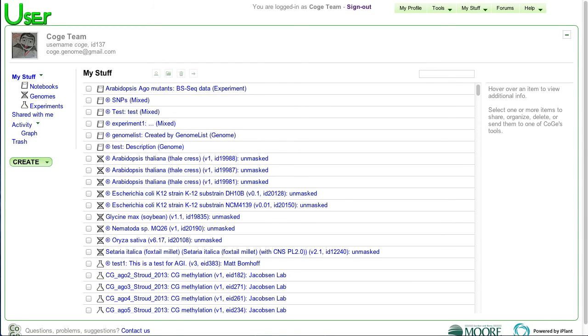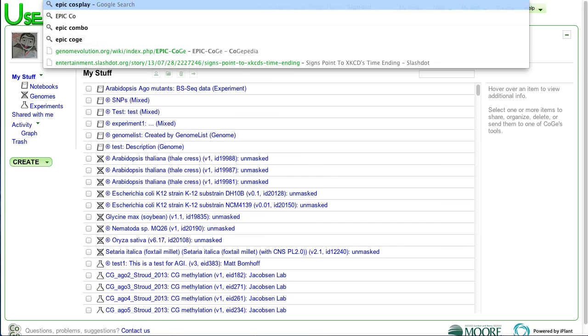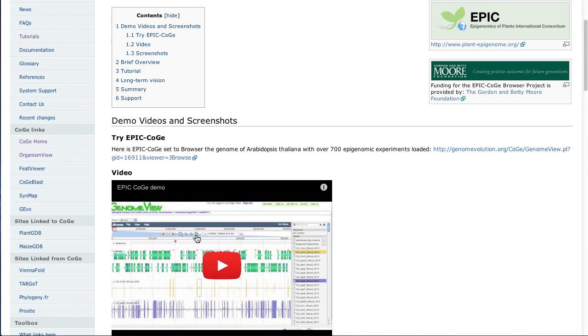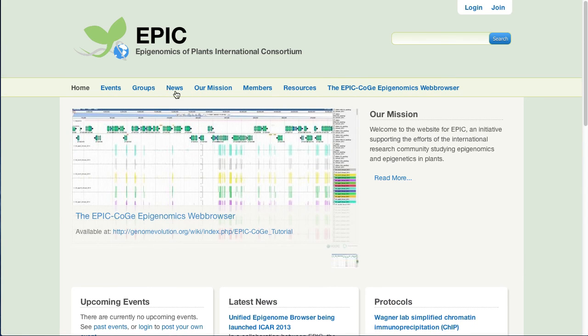So hope you found that useful. If you do have any questions about the EPIC-CoGe project, just do a Google search for EPIC-CoGe. You'll get the overview of it in Cogepedia. We've got a tutorial page up. There's a video on how to use it as well. Definitely visit the EPIC project, which is the Epigenomics of Plants International Consortium.